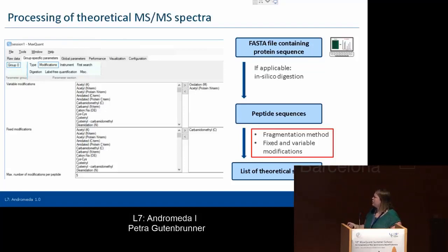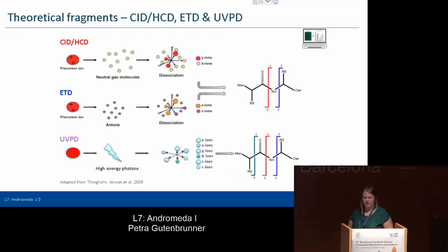Yes, I forgot to show you where to set the enzyme. This will happen here in the digestion step. Then I mentioned the fragmentation method is also important, and here I quickly explain the most common ones.